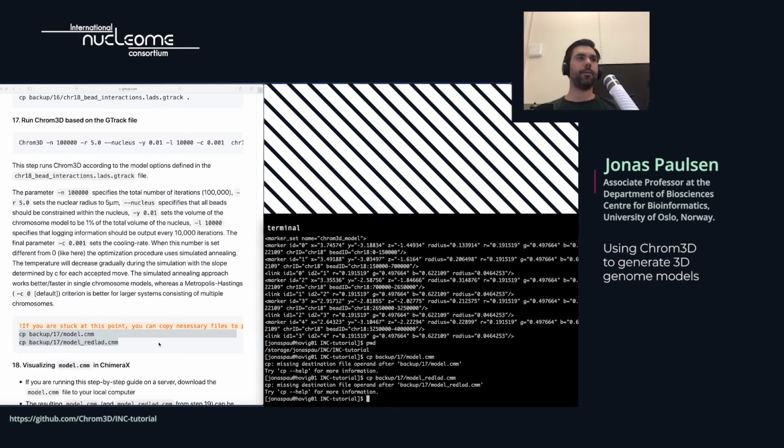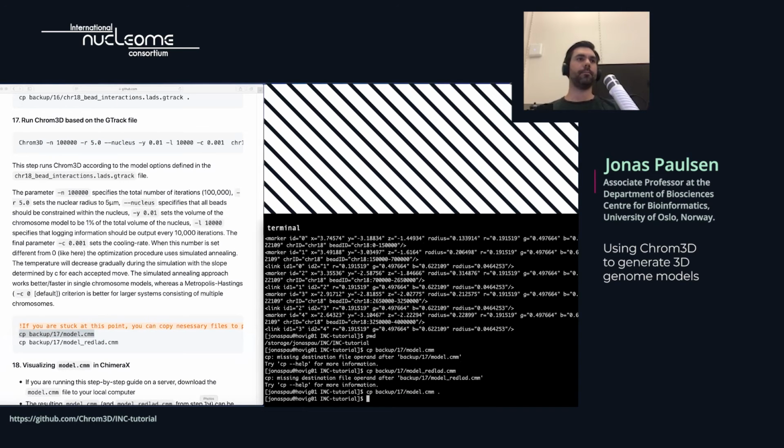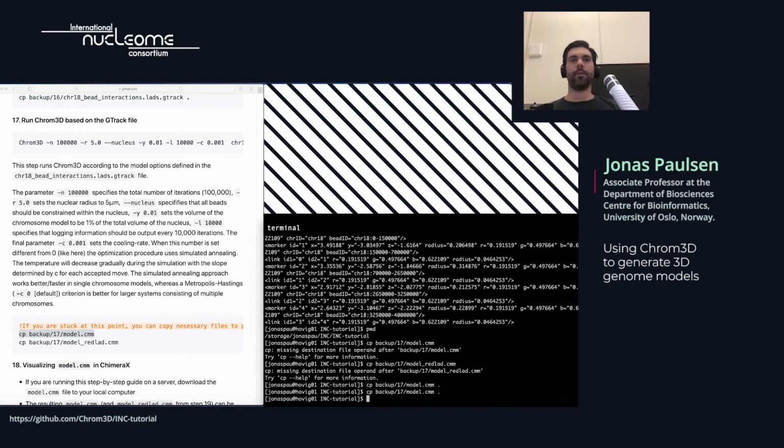Yeah, sorry for that. There is a dot missing here actually. So if you have problems here, you should do copy model.cmm with a dot here so that you actually copy it correctly. So there's a dot missing here and here. So please, if you need to copy, you should add this dot here basically. Sorry for that.